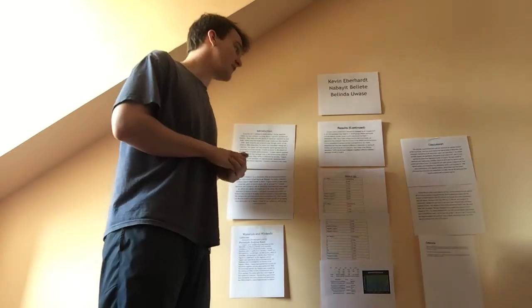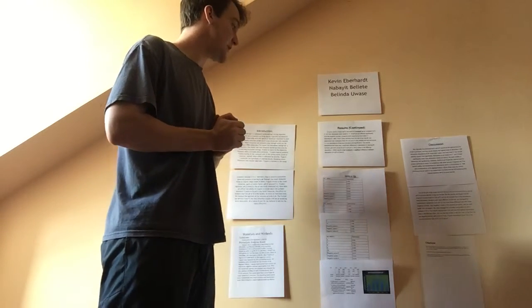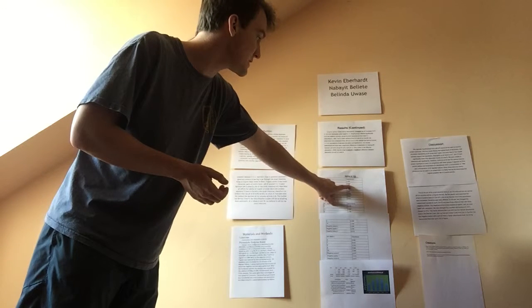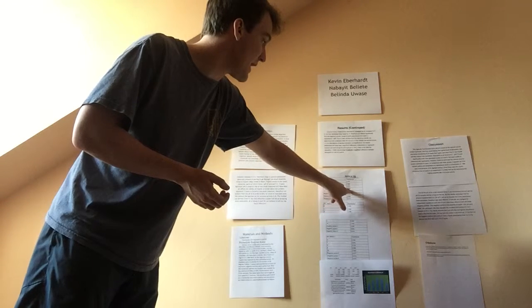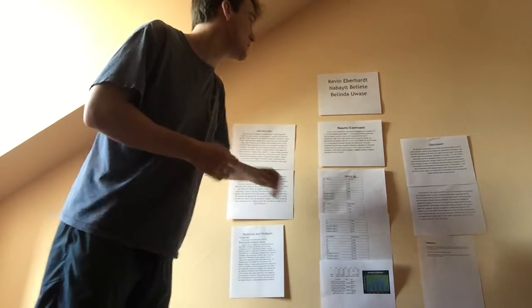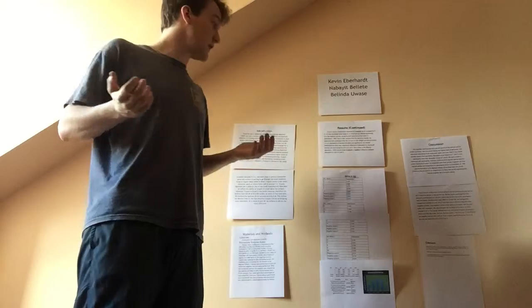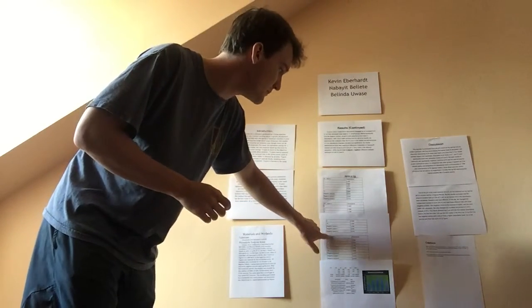So we found that the enzyme activity increased as pH increased to 8 and 9. As you can see here, for example, batch 1, we have absorbance of 0.48 at 6, 0.638 at 7, 0.773 at 8, and then it goes back down to 0.730 at 9, and 0.447 at 10. So it increased to 8, and then it decreased after 8 for pH levels, the absorbance did, which is what we were expecting. However, we did have one outlier here.